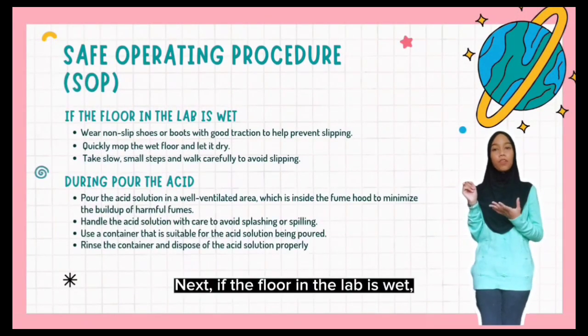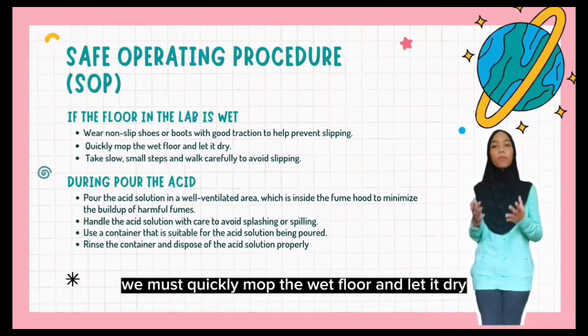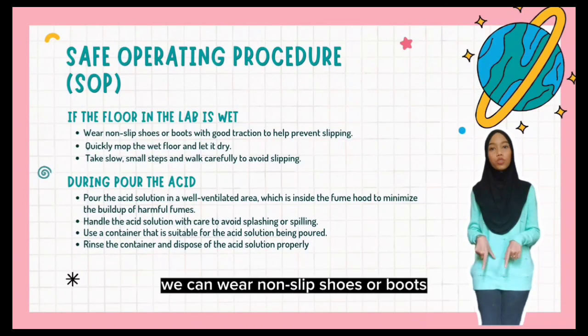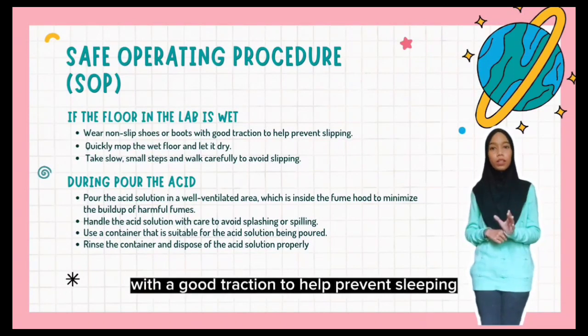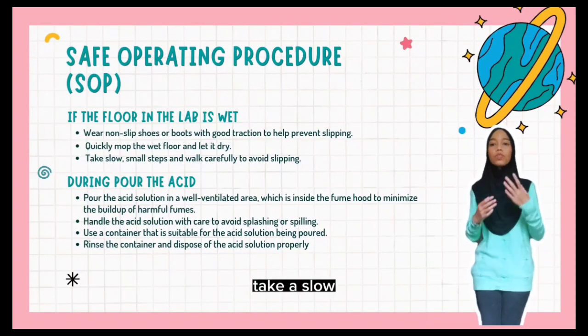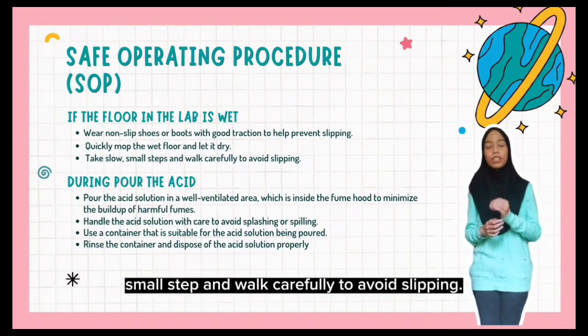Next, if the floor in the lab is wet, we must quickly mop the wet floor and let it dry. Other than that, we can wear non-slip shoes or boots with good traction to help prevent slipping. Lastly, take slow, small steps and walk carefully to avoid slipping.